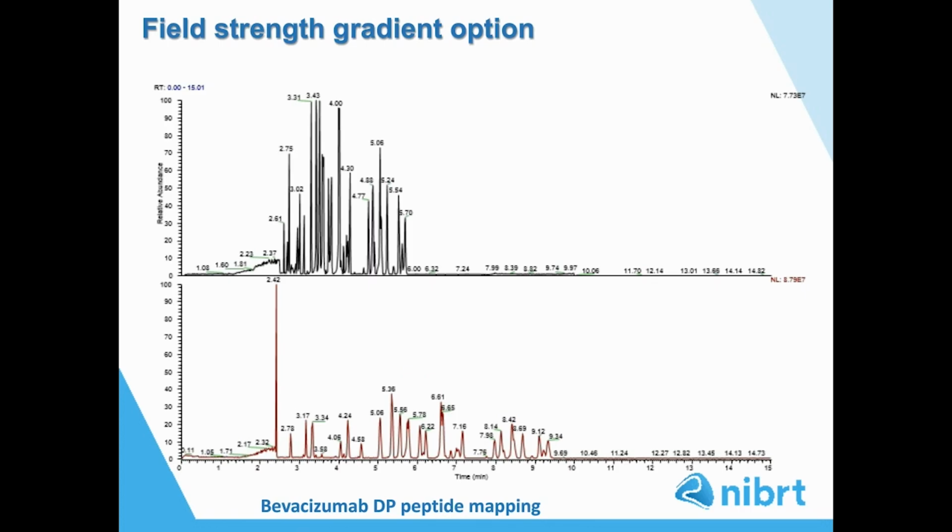And during the analysis, MS data were also acquired, allowing confident identification of the tryptic peptides. The separation is obtained in 10 minutes, and the total runtime was around 16 minutes, also considering the sample delivery from the autosampler to the CE device. So this also makes this workflow really an incredible instrument for high throughput.